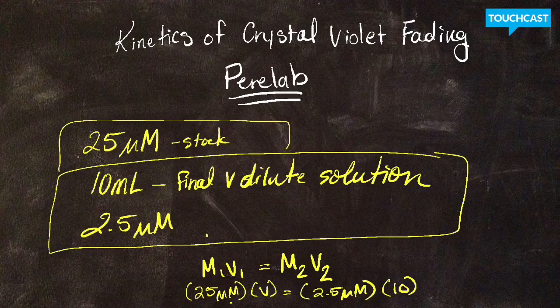All right, so go through some math, grab your calculator, check your work, and now that you know the formula, the general formula for all of those, these should be really easy. Just remember, the missing volume that you're solving for is going to be the volume of the concentrate. You also need to put how much water you need to add to that concentrate. Just remember, the final solution needs to be 10 milliliters, and you are solving for a much smaller amount. All right, and that smaller amount is the volume of your concentrated solution.